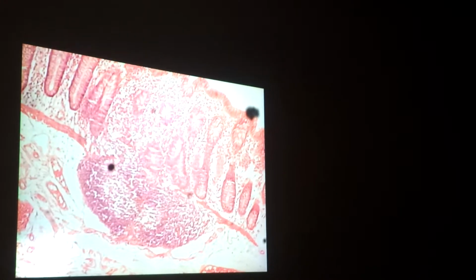I have asked, since this shows the separation of the layers better than any slide. On the 4X, this microscope doesn't have 4X, that power like your scope. But on the 4X, everybody, you can see all these layers pretty well. Like right down in there, all this stuff down in here. You can't see the pointer going around, but all that stuff that you see, that is submucosa. This down here is muscularis.